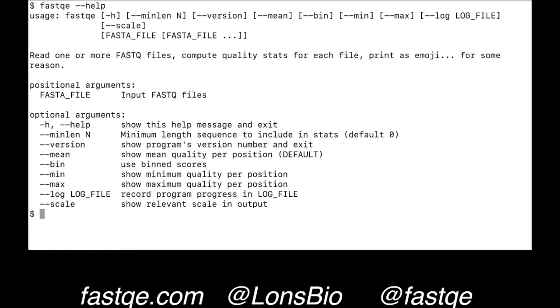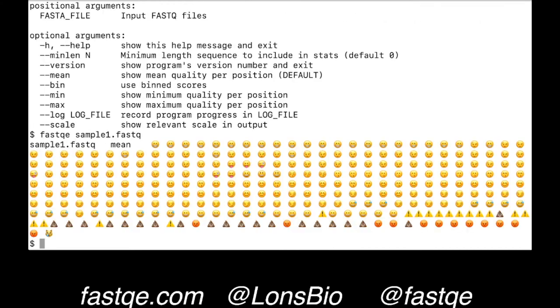So to get started, let's run it on a sample file. Here's our sample. And we can see here the quality as emoji. This is the average quality across all the sequences in this file. As you can see, the quality is quite good at the start of reads and tapers off towards the end.